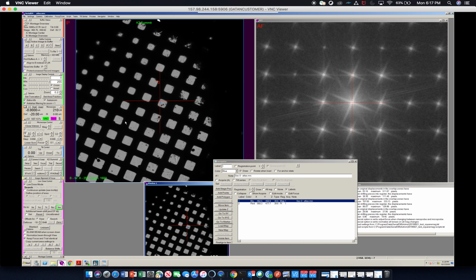That's not always the case. Sometimes it's best to collect on these very small holes if you have unique ice, and sometimes, and this is really great if it's the case, you can collect on these really large grid squares that give you a lot of information.